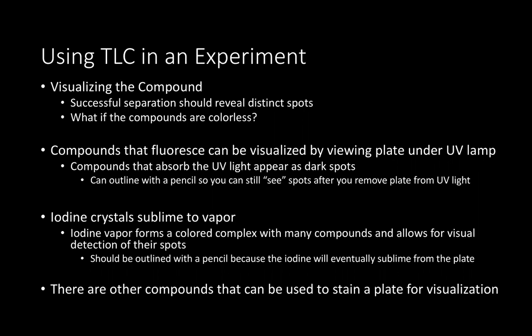Once again, your colored spots from developing in the iodine chamber should be outlined with a pencil, because eventually your iodine is going to sublime away from the plate and you won't be able to see those colored spots. In terms of how long you should leave your plate in the iodine chamber, I would say about 2 minutes. They're glass chambers, so you should be able to actually see the interaction of the iodine vapor with your compound and see when the spots have been fully visualized with the iodine. These are the two visualization techniques we're focusing on for this lab.